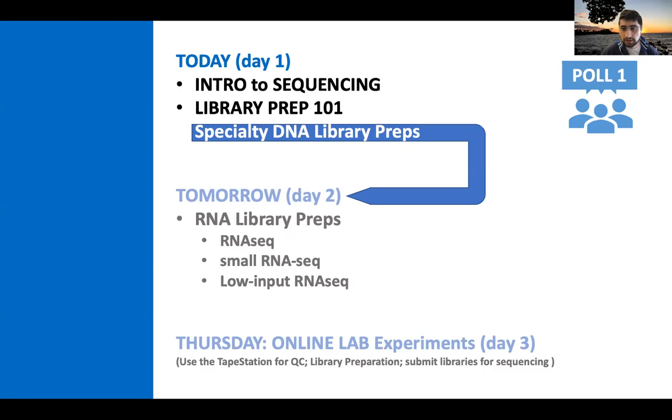So what I want to discuss with you today is workshop 16 from the UCLA QC Bio Collaboratory. The workshop is divided into three days. On day one, we're mainly going to talk about sequencing and DNA library preparation, while on day two, we're going to do some specialty DNA library preps and some RNA libraries. And on Thursday, we're going to experiment with a new online lab session.